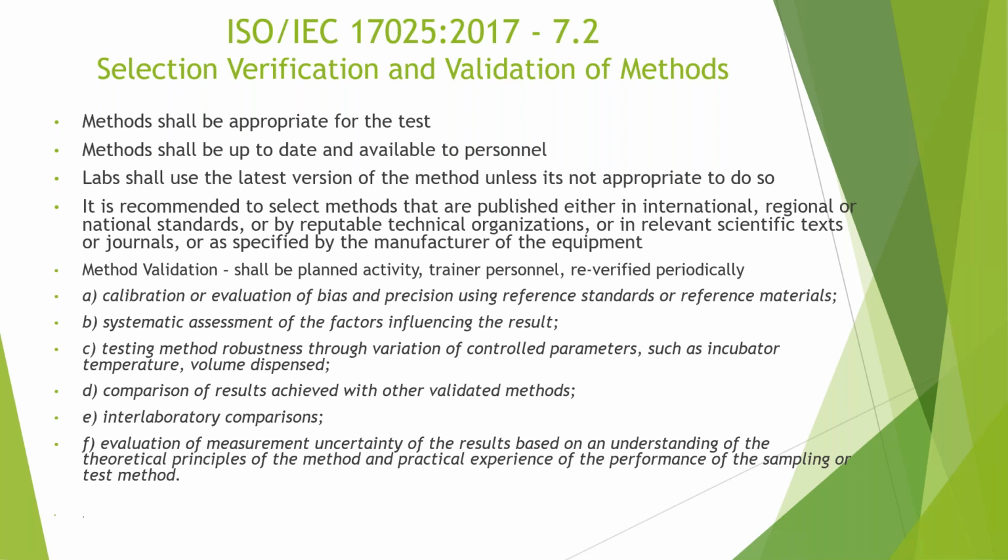As an accreditation body, we accept laboratories developing their own in-house methods. This area has been brought into the cannabis industry, which is great, because we understand that it might be a quicker method to use for your micro testing. But there are things that we expect as an accreditation body from the laboratories.